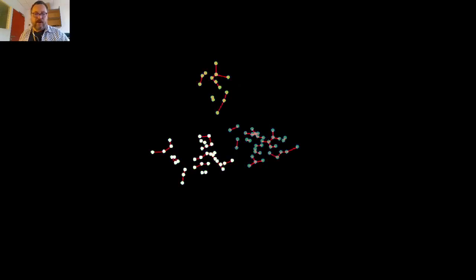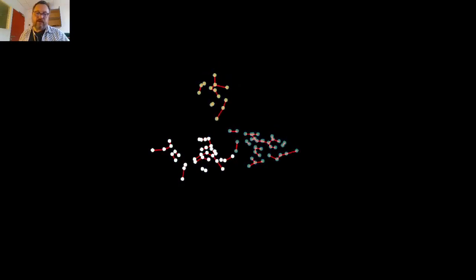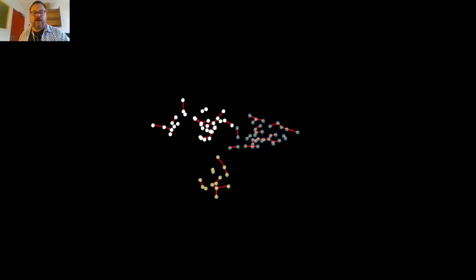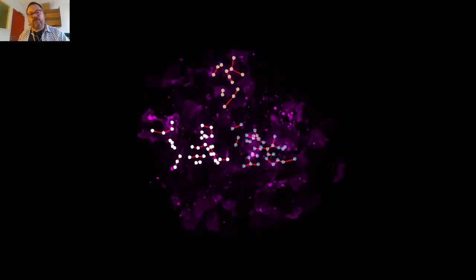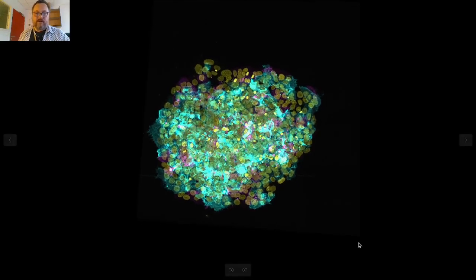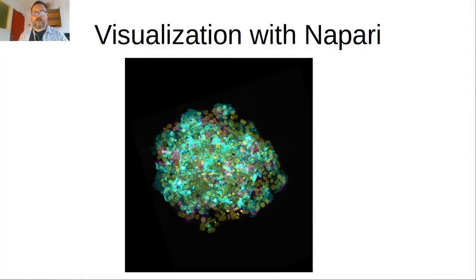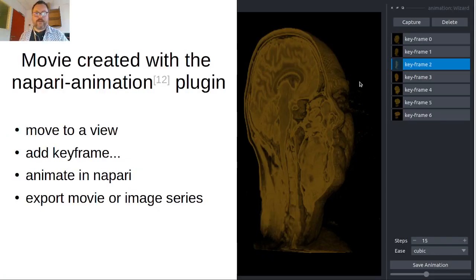And here we have the clusters, the zones with the high density of nuclei, and the nearest neighbor connections inside of these clusters. Of course, our tool will report the distances in result tables, the distances within the clusters, and the distances outside of the clusters. Okay, that was the first example.